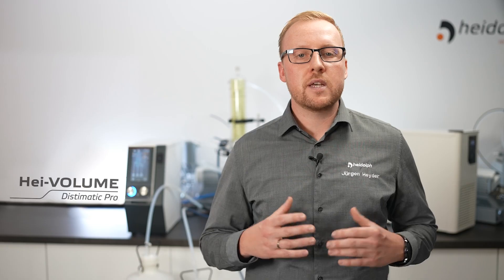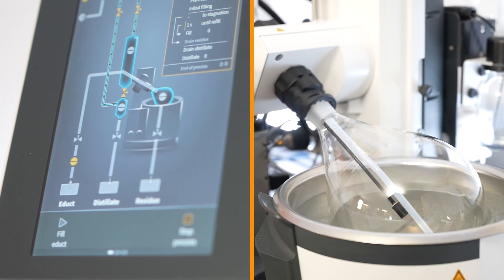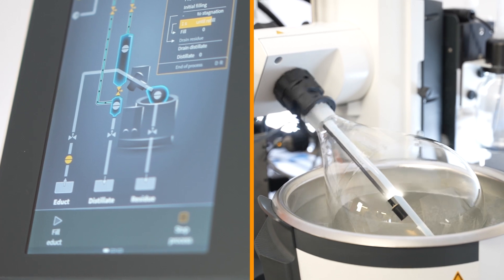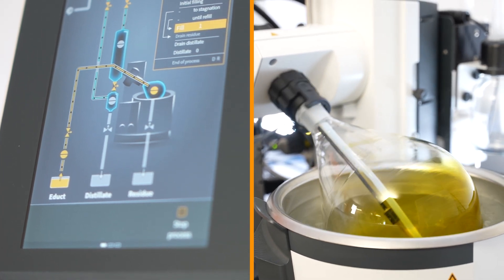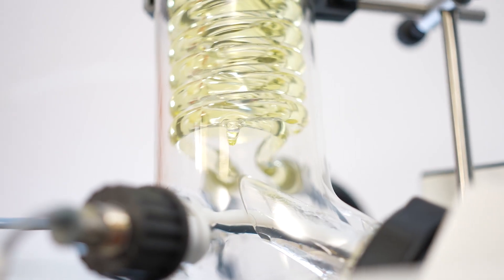My colleague Jakob will explain the function principle in detail. Thanks Jürgen. In our example we will separate ethanol from a botanical extracted oil. There is an initial filling at the beginning of the process and seconds later the evaporation takes place and the first solvents get collected inside the receiving vessel.